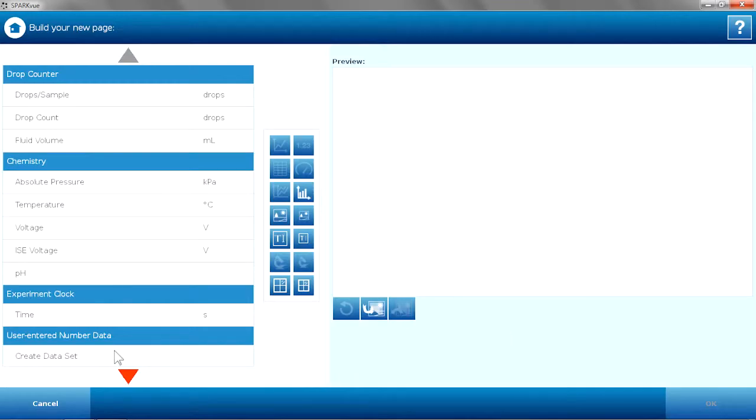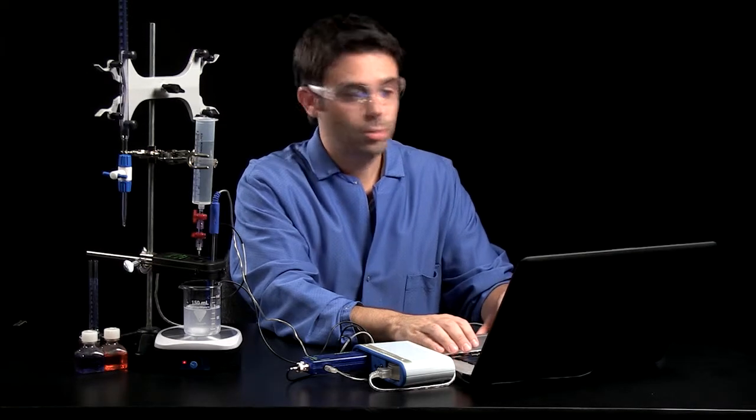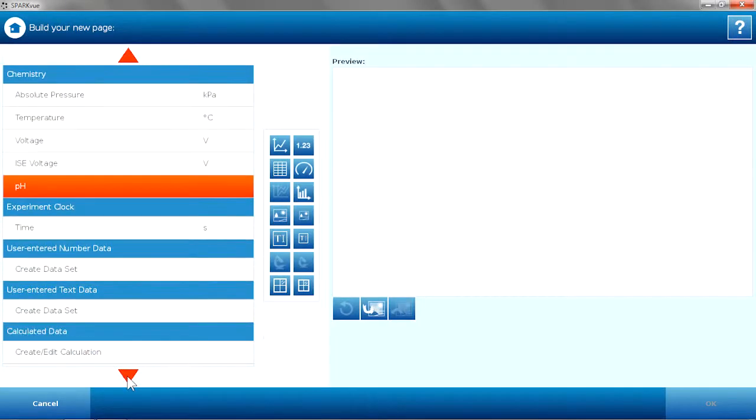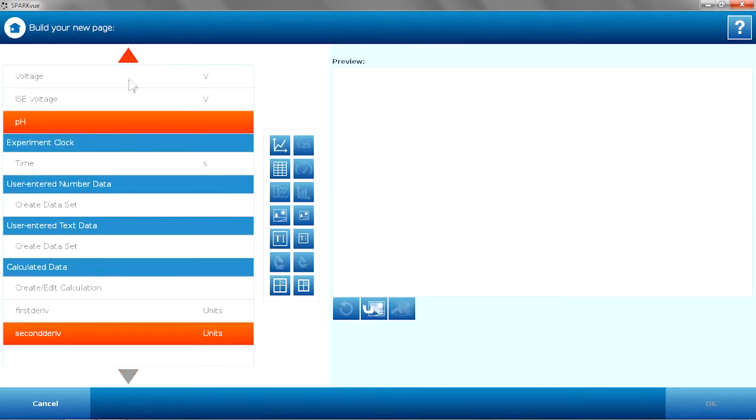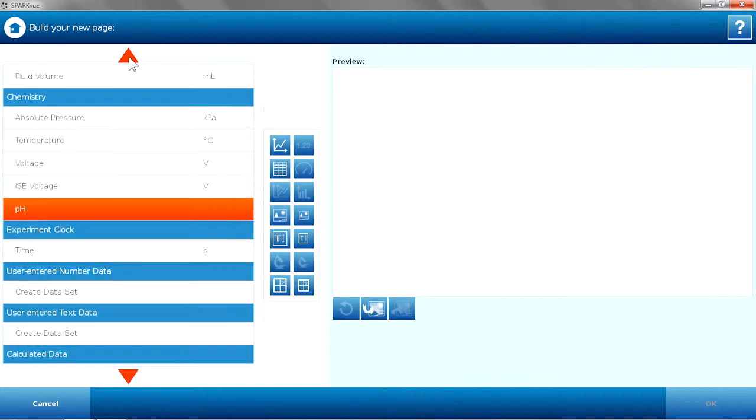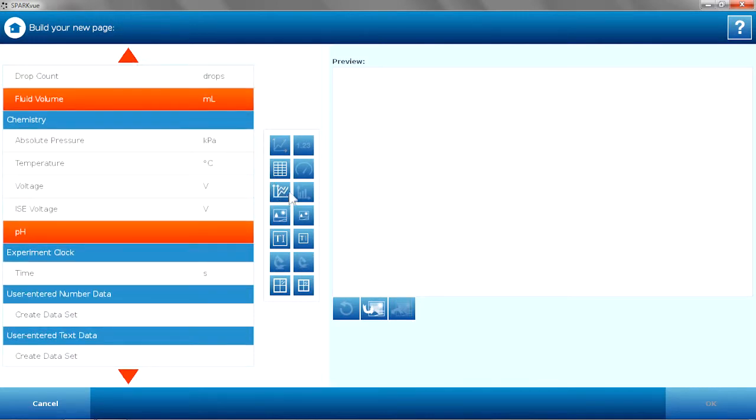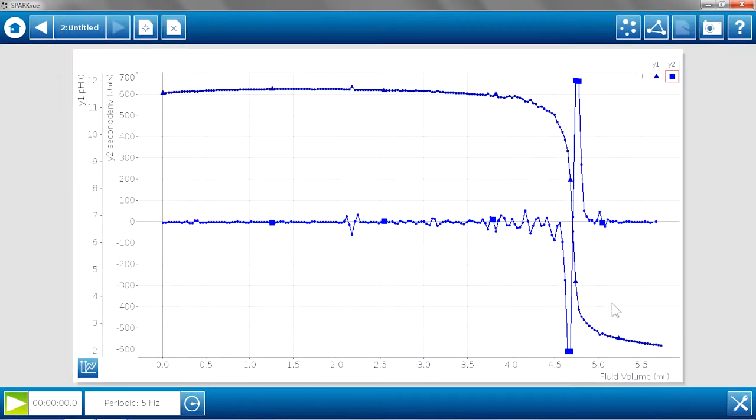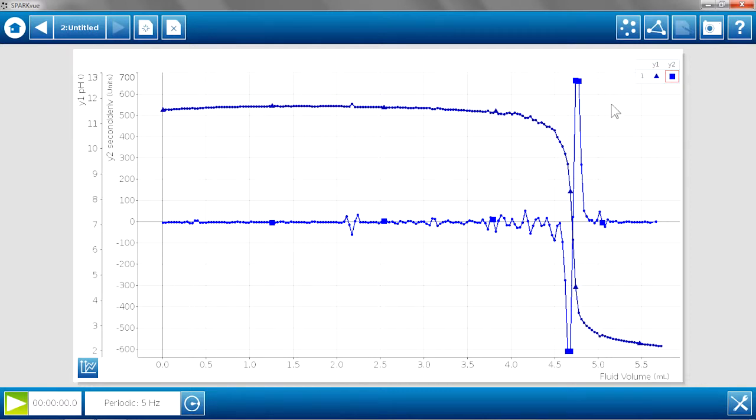And now I'm going to take advantage of SparkView's multiple y-axis. So I'm going to plot pH and the second derivative, both on the same graph, versus the fluid volume. Here's my multiple y-axis feature. And now we have both of those graphs coming in and showing you the equivalence point. The pH's equivalence point should be right around 7 because it was a strong acid, strong base. And the second derivative shows that by showing you where the plot crosses the 0. So we see a nice indication of the equivalence point using that second derivative.